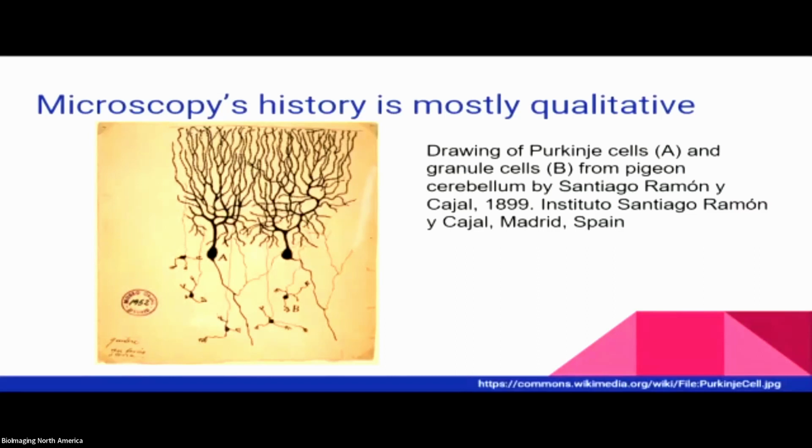But we have about 400 years of history of looking at images down a microscope and creating beautiful images like this that I could not create, but judging what happens in microscopy by what our eyes can do. And we have maybe 40 years of experience of sticking these things through computers. And so there's a little bit of a consideration that image analysis is a bolt-on or an add-on, because historically it is, but that doesn't mean it necessarily should be going forward.